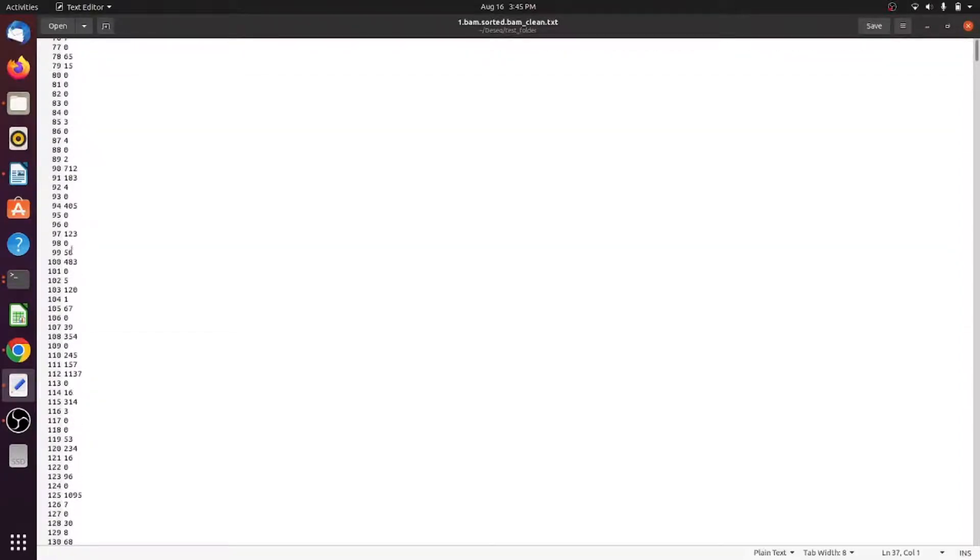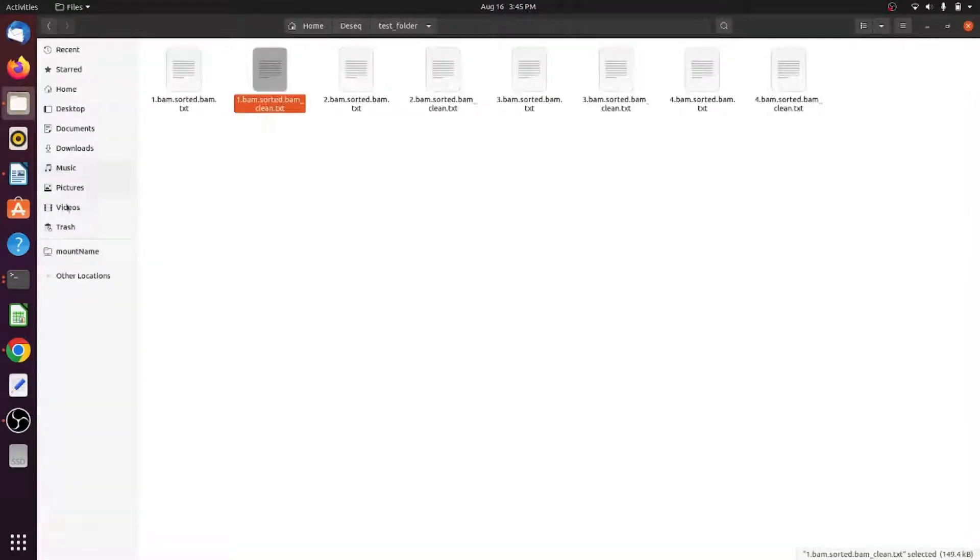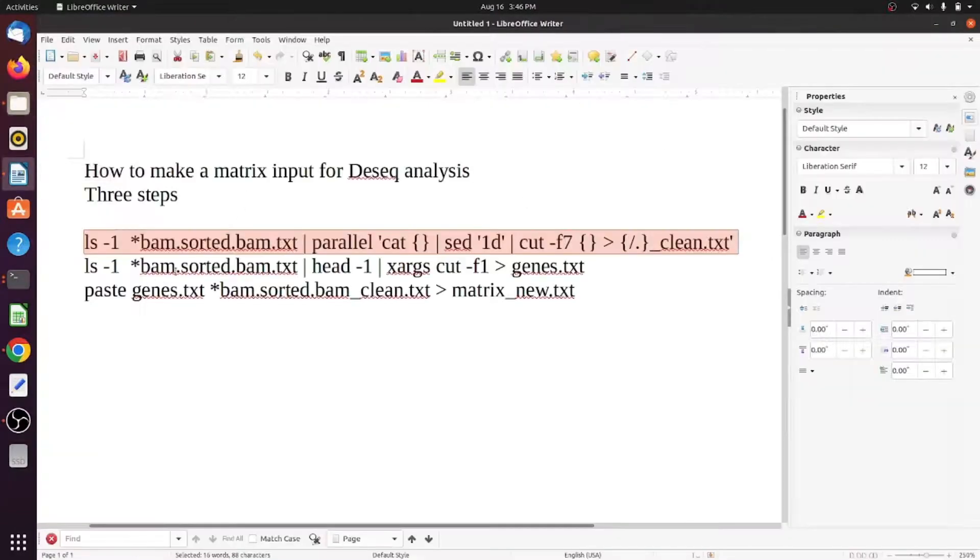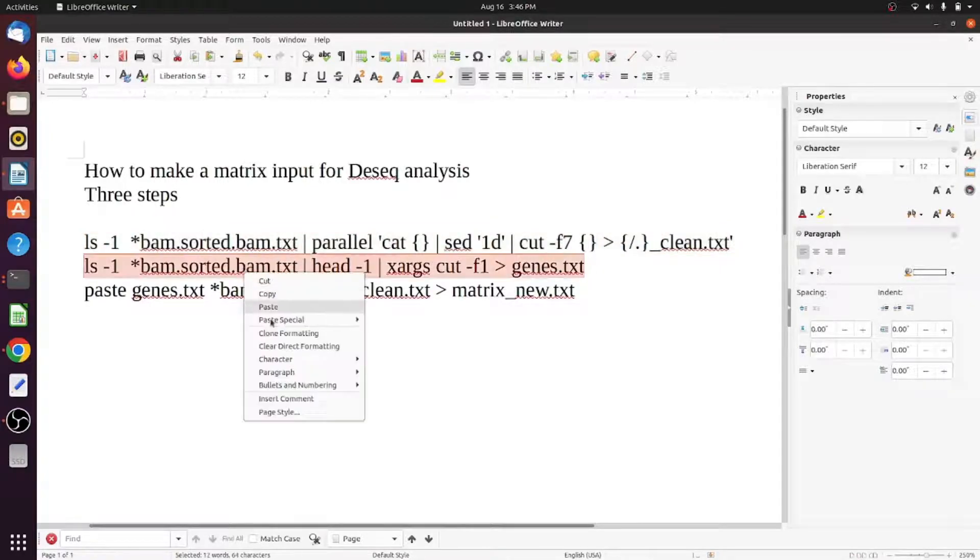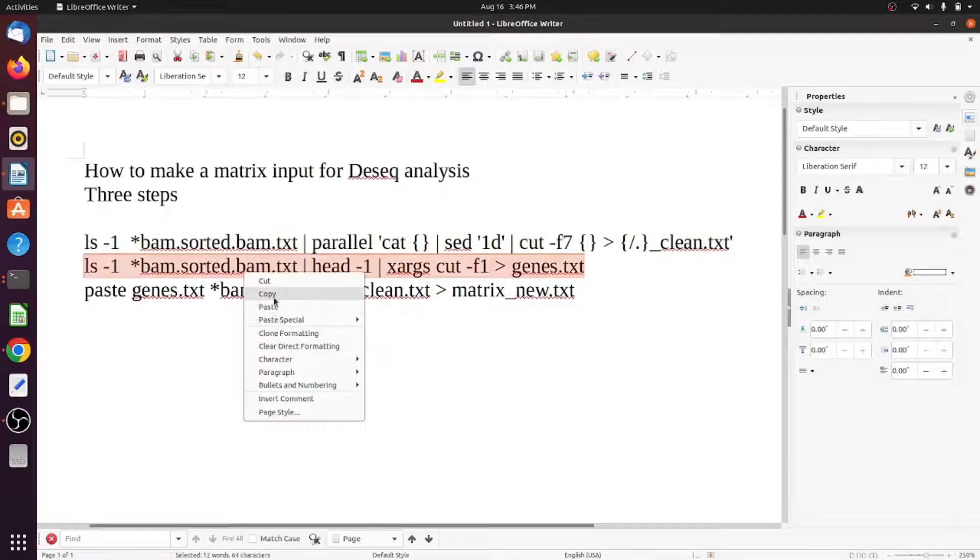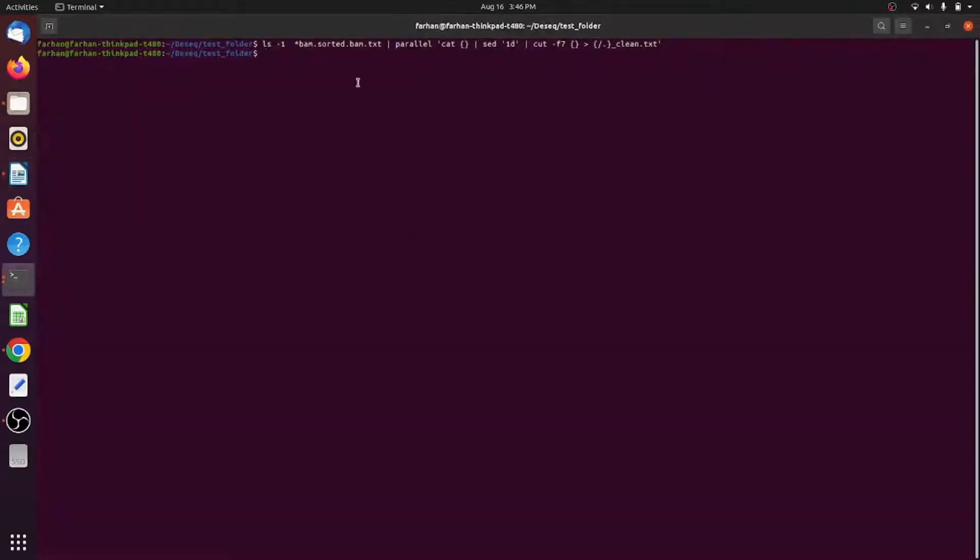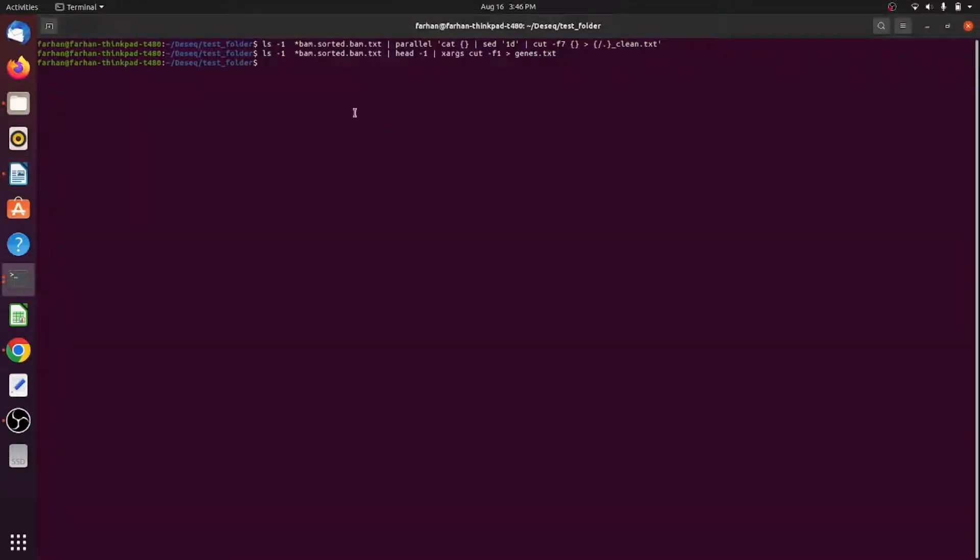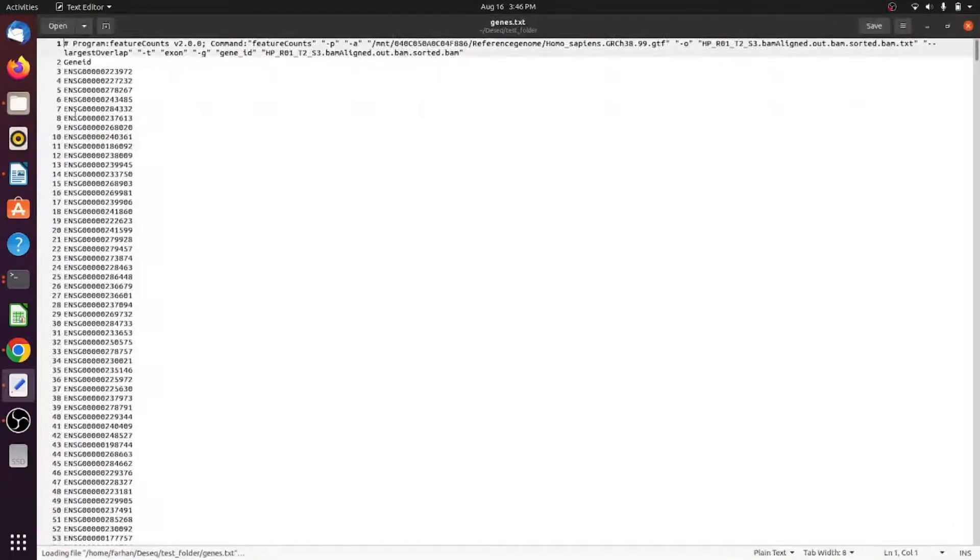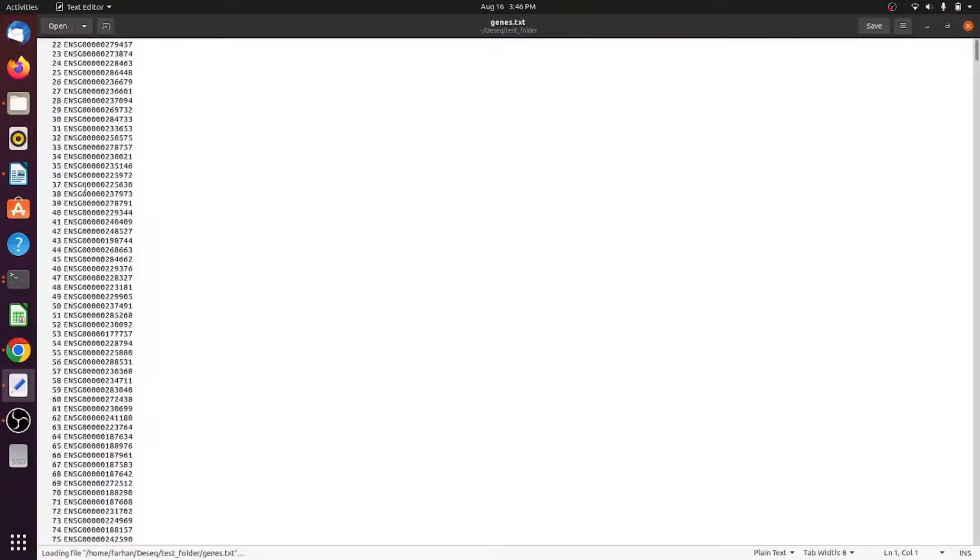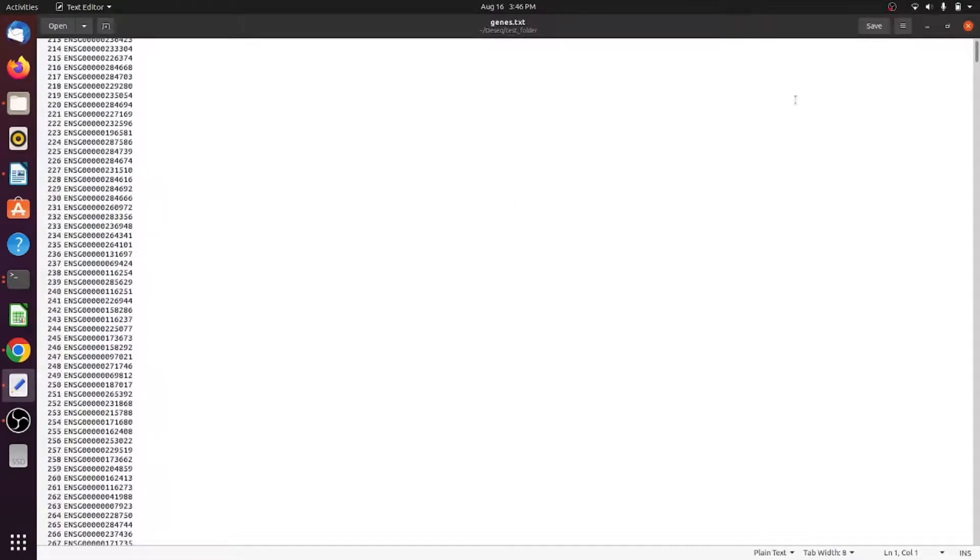The next command will actually extract the genes from all the files. If you copy this command and paste here, just put enter, and you can see there is a gene output here. If you open it, you can see all the list of genes in the samples - around 60,678 genes.